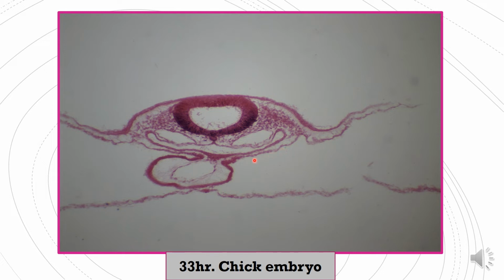lateral plate of the mesoderm, and this is the dorsal aorta. And when the complete lateral folding forms the gut tube, in this section the gut tube is represented by the pharynx. This is the wing of the pharynx.